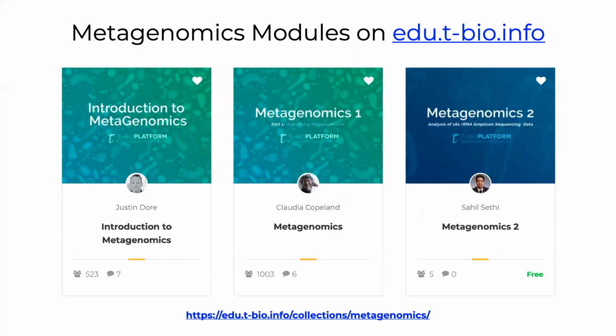Now we have these 3 courses. They're a little bit different here displayed on the screen from what you'll find on the Science Coach website, but nevertheless, they cover the same exact topics. Introduction to Metagenomics will introduce you to the general overview of different terminology that you have to know before you jump into metagenomics. Metagenomics 1 will talk about metagenomic data from some of the human microbial studies. How do we annotate and how do we find specific types of bacteria in our metagenomic data? And Metagenomics 2 will focus exclusively on the 16S ribosomal RNA, which is something that we'll talk about today.